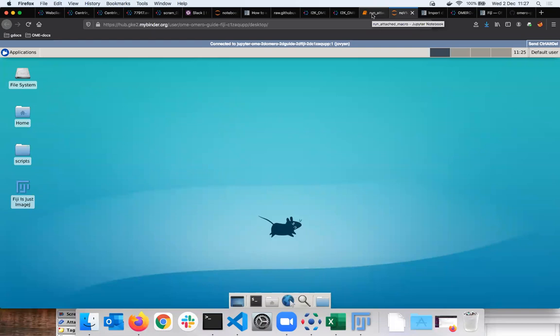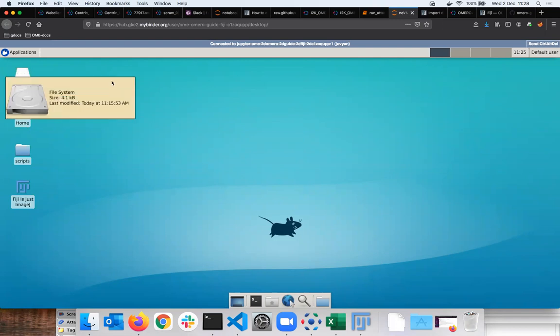As a side project we are starting to host our own system ourselves to offer more resources for that. But it allowed you to show what can be done with your data. Let's say you publish your data; they don't necessarily have to be in OMERO. In that case, they were in OMERO, but they could be available in Zenodo or somewhere else where you have put them public. Obviously, some of the code will be slightly different, but the gist is there.